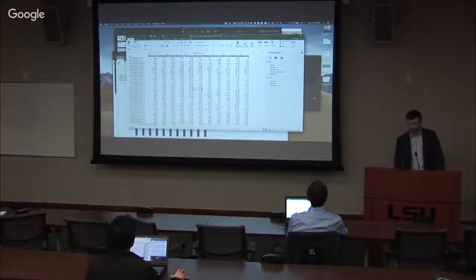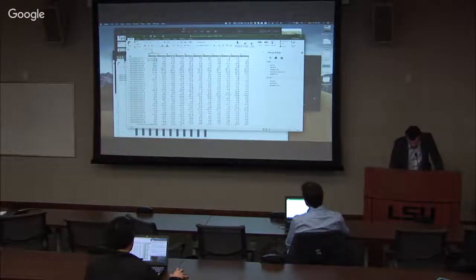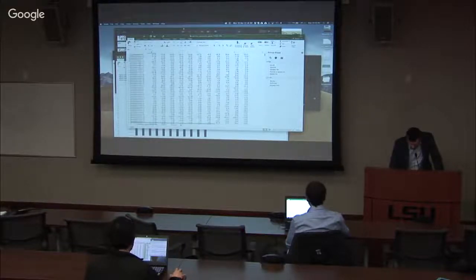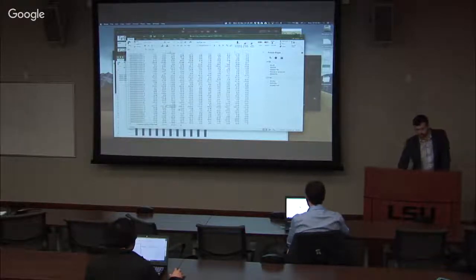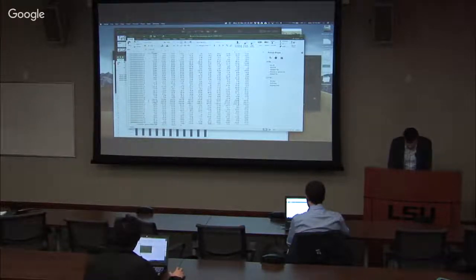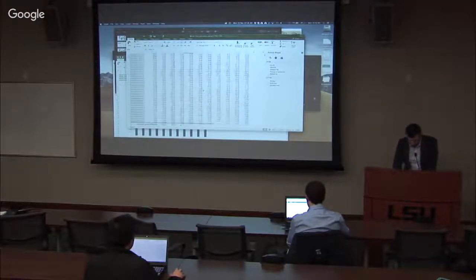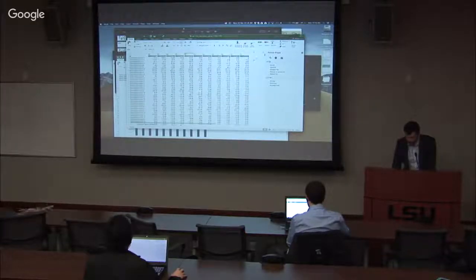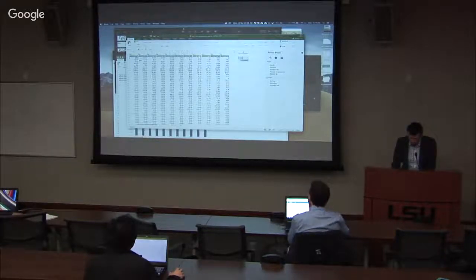Okay, so this was the original table, and you can see just from the range of numbers that you have in this table, right? You have very small values like 8 and even 0.1, and then you have fairly large ones in the thousands, like 2,500 here. So you have a huge variance of data that you're dealing with. And one of the ways to see what we're looking at is to take the same data point and transform it into a natural logarithm scale.